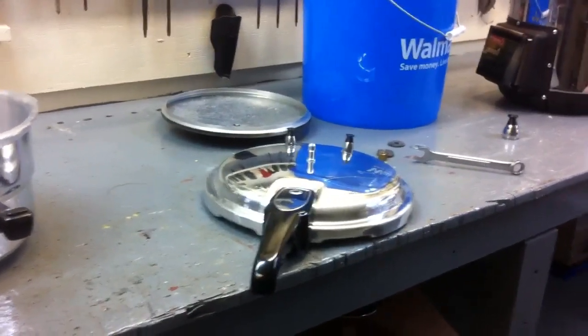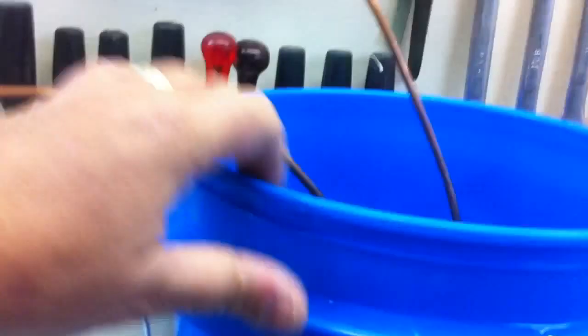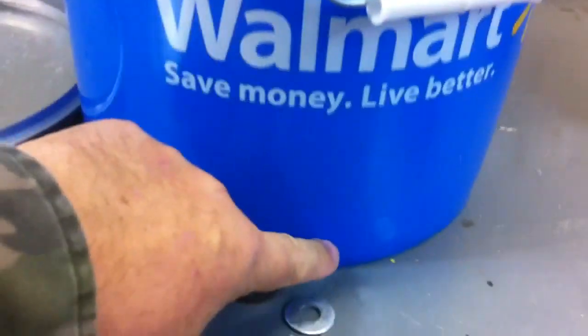A couple of people have told me I should run the pipe up out of the bucket and into another vessel, because the water leaking out from around the grommet might get into my purified water. I've done that.